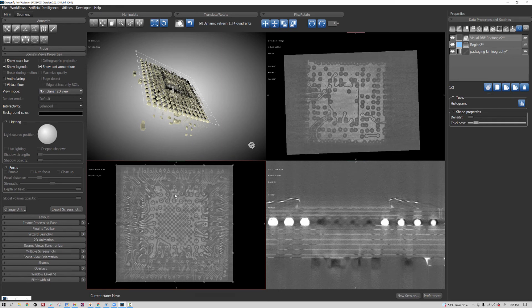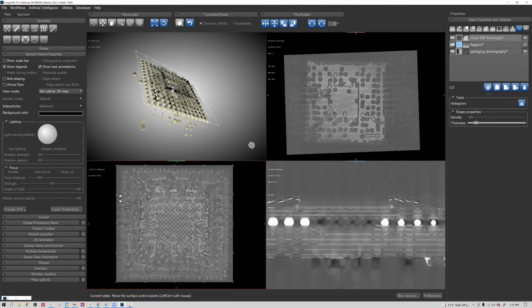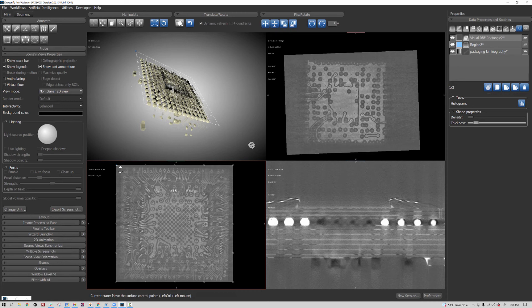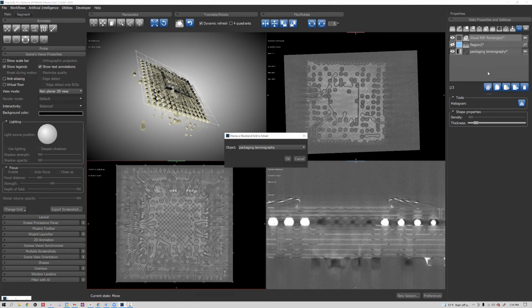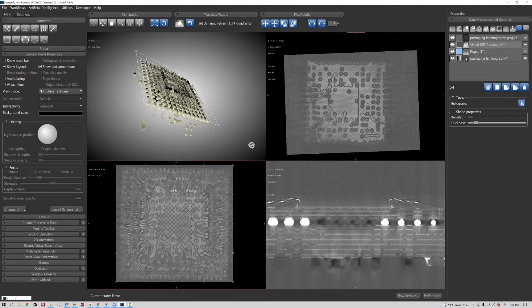Now besides doing this for visualization, you can also export the resampled plane as a separate 2D image. All you have to do is right-click on the visual RBF and ask for extract projection of a structured grid, which could be either the image or its segmentation. So now I have a single 2D image slice that is this with these corrections.